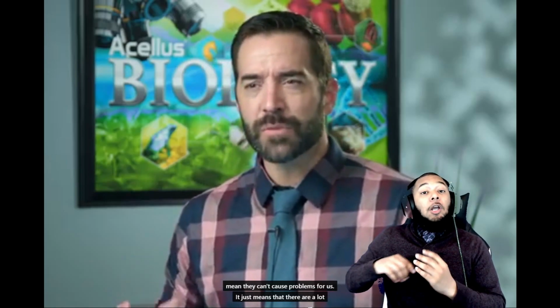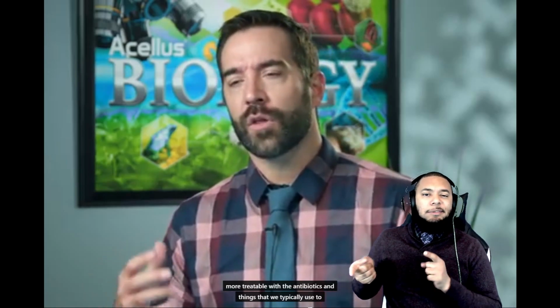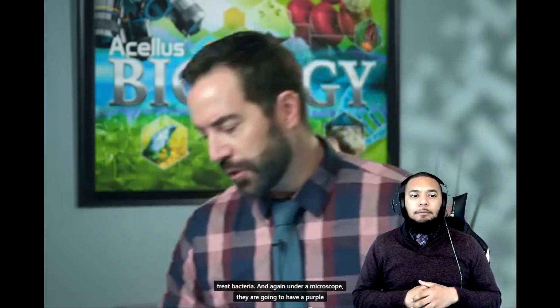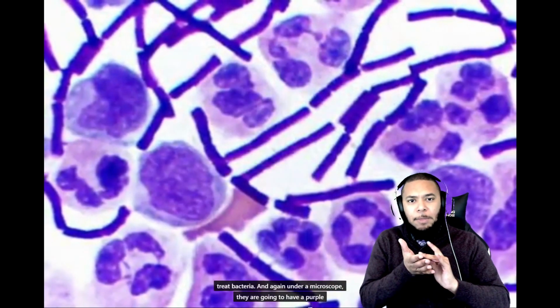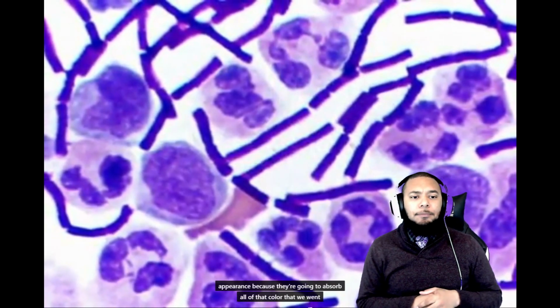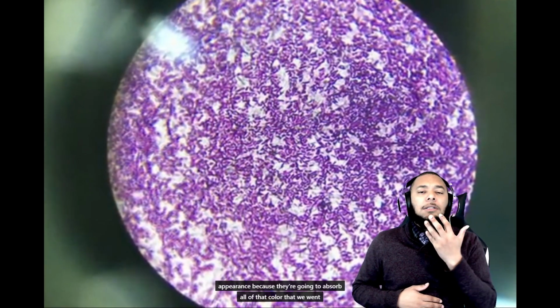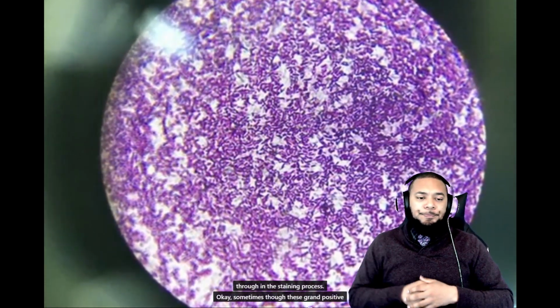It doesn't mean they can't cause problems for us. It just means that they're a lot more treatable with the antibiotics and things that we typically use to treat bacteria. And again, under a microscope, they are going to have a purple appearance because they're going to absorb all of that color that we went through in the staining process, okay?